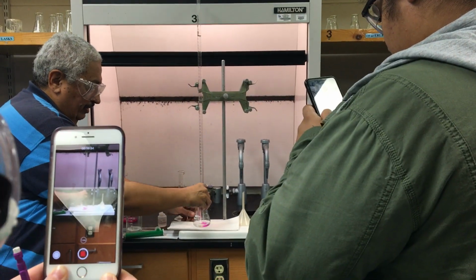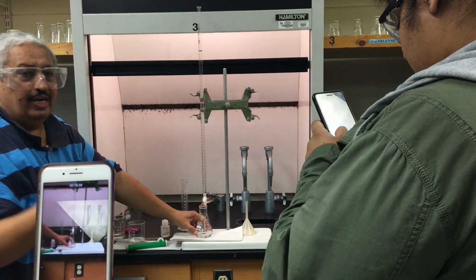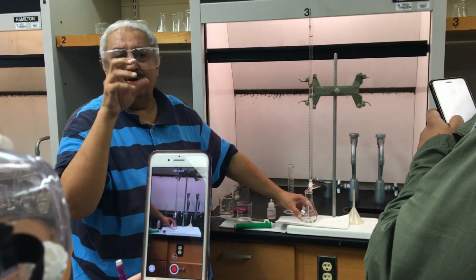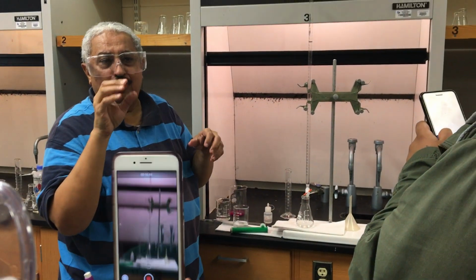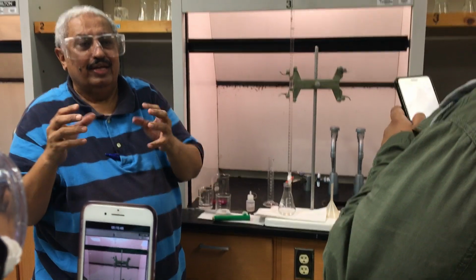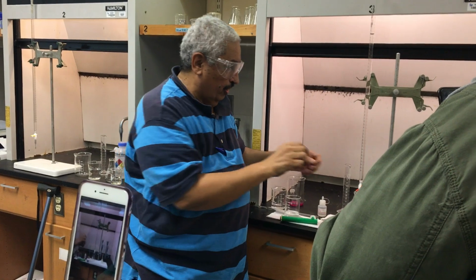With that, that's the beginning here. See here, I'm adding, and then keep what? Keep an eye on the color. The color will start turning pink, on and off, on and off. When it comes to the end point, the pink will remain for more time before it disappears. Then that means we are very close to the end point, correct? So we are determining the end point by color change.